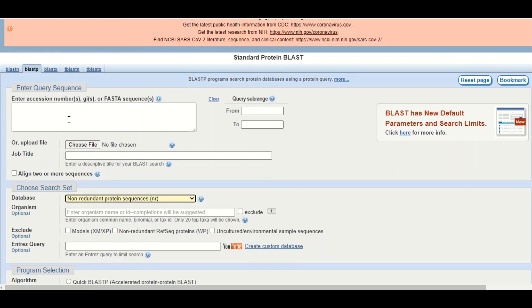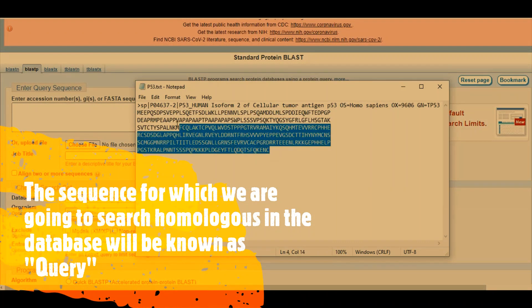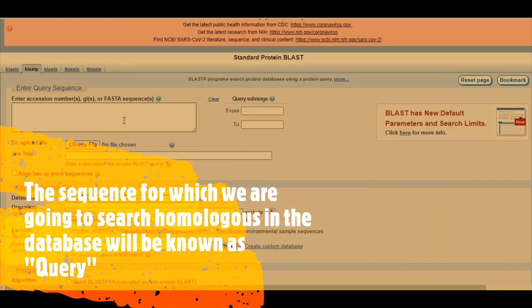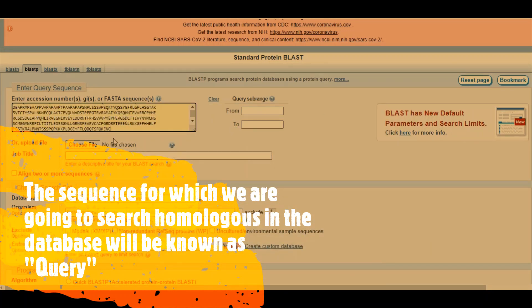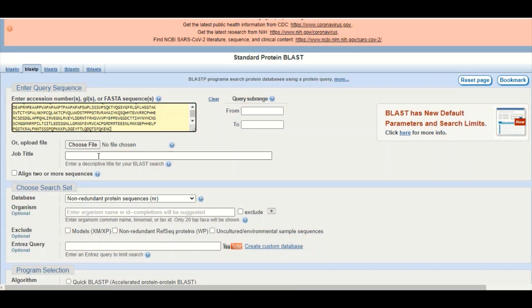In this box we will paste our protein sequence that we want to search in the protein databases. We will copy our protein sequence and paste it here. You can also upload the protein sequence in the form of a FASTA file — either option works. The job title is not mandatory but it is always good to provide one. Our protein is the P53 human protein, so we have given the job title 'P53 human'.